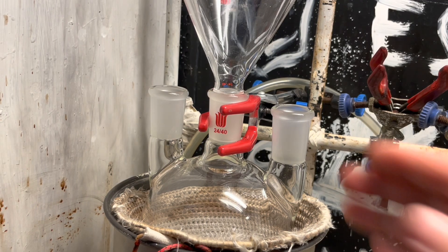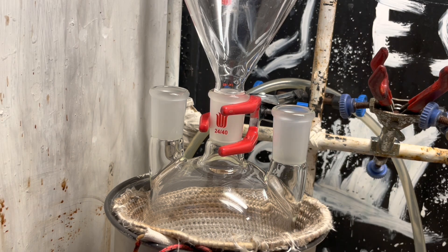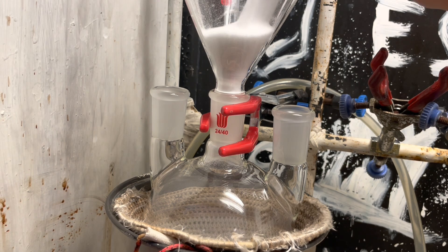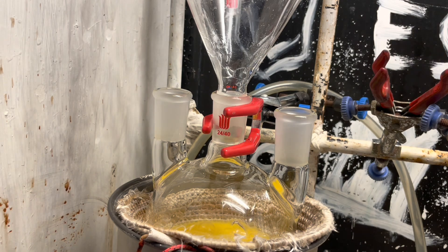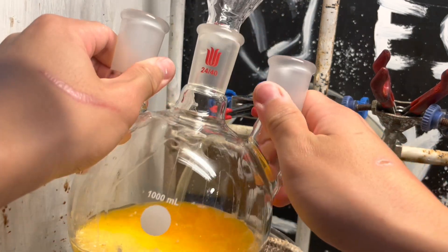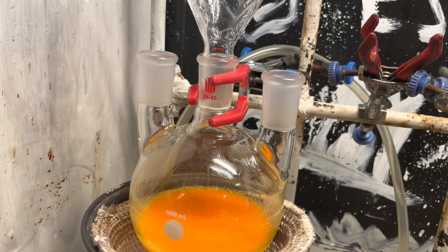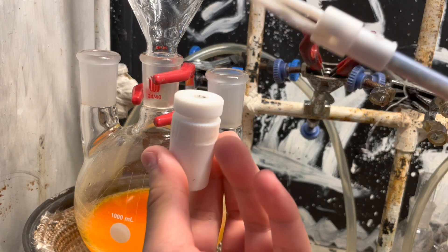Here I have a three-neck one liter flask in a heating mantle. First we're going to add our TCCA and our potassium bromide. Here's 100 milliliters of water. You can see there's a yellow color. I believe this reaction actually forms something like a tribromo cyanuric acid. You can use a stir bar, but what I'll be using is this mechanical stirrer.